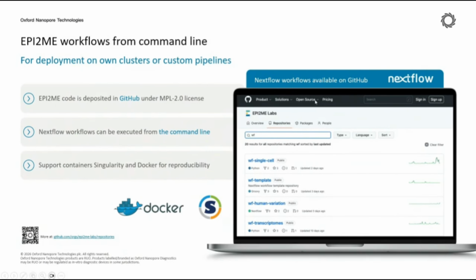For users who prefer the command line, there are some resources available for you as well. These pipelines are also available directly from their GitHub repositories. Normally we just use the Docker or Singularity containers to run the analysis. We normally do not need to worry about how to set up the software or pipelines, because everything has been contained in Docker containers and so on.